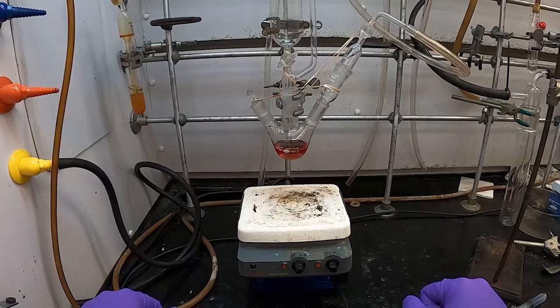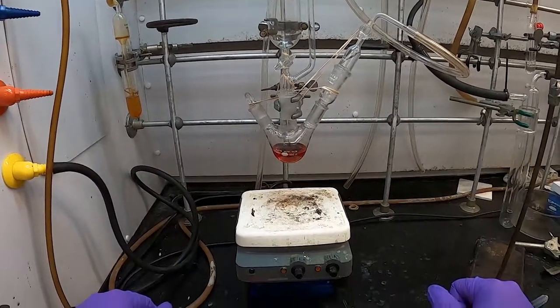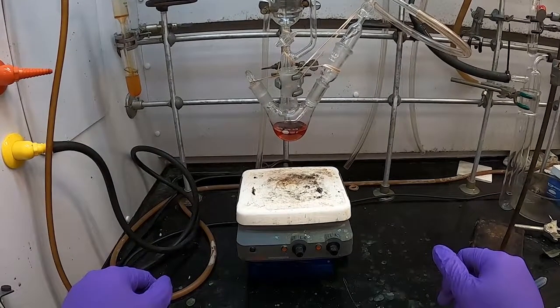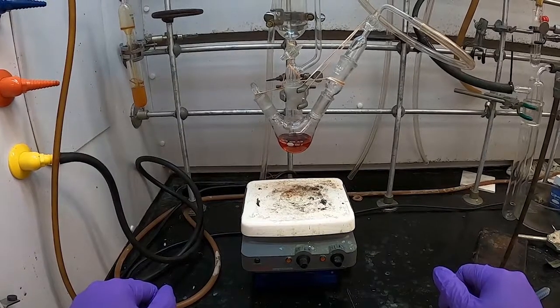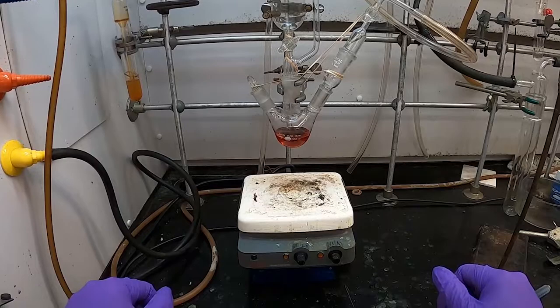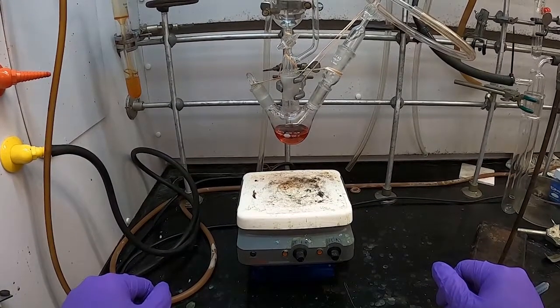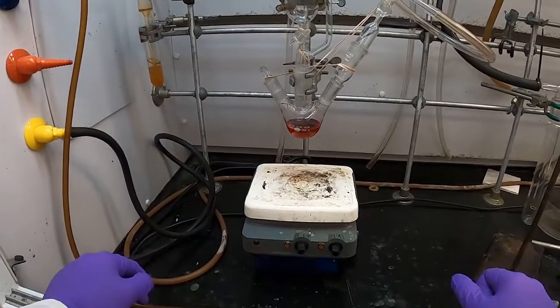Some reactions require us to cool our flask or container as we're performing the reaction, or before a certain step. For that, we utilize different cooling baths. There are some interesting and important things to take note of before we begin to cool our apparatus. So I've got this mock apparatus with our nice red solution here.